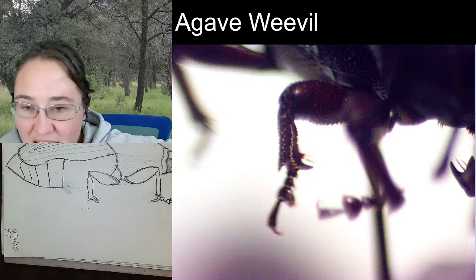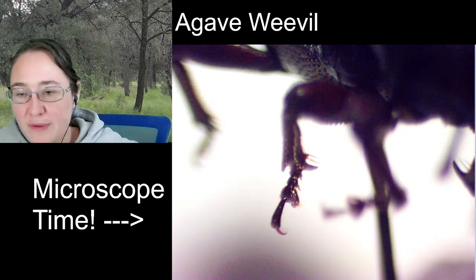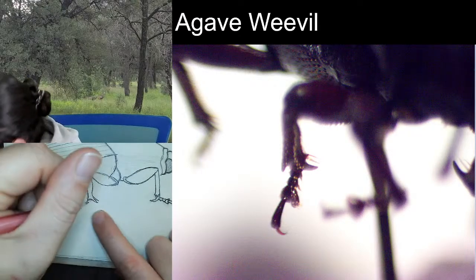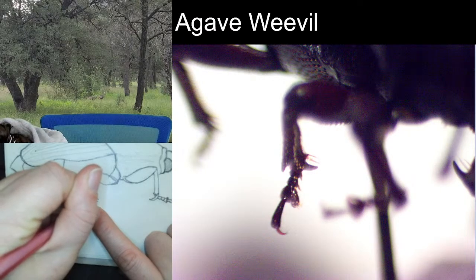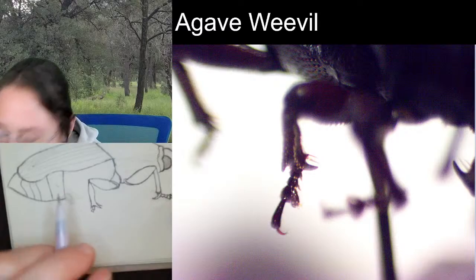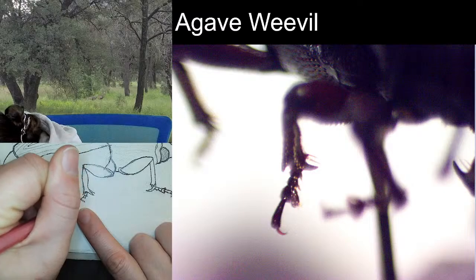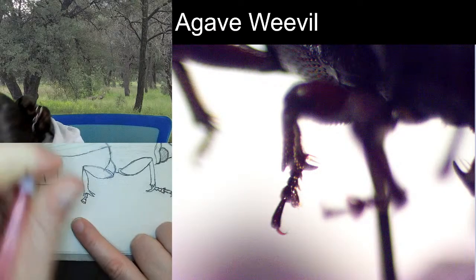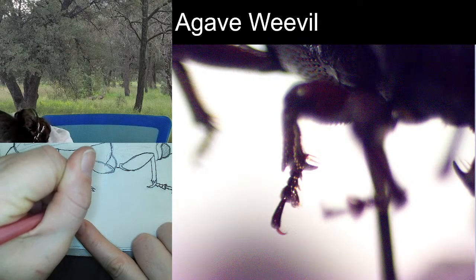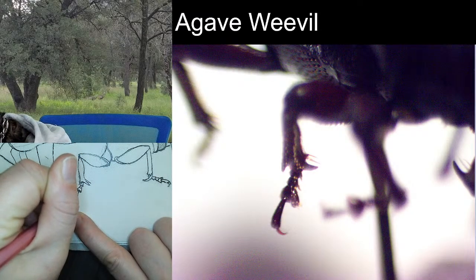And we've got the same tarsal segments as our front leg. So apparently four, but actually five, because they're trying to trick you. Alright, so we've got two little triangular segments here. One, two. About the same as the front leg. They might have to be a little bit bigger. That's fine. The third segment has that oval at the end of it so that the fifth segment can come out the middle. And we're going to go five. And two tarsal claws. One. Two.